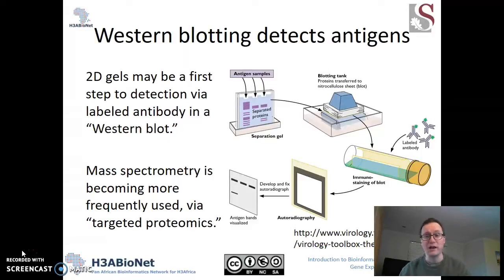So Western blotting is the answer to that. Now, Western blotting has long been considered kind of the gold standard for how you prove that this protein you're claiming is really present. And yet, there are a lot of weaknesses to this. What if you can't get an antibody that is specific to this protein of interest? So a lot of folks are trying to move away from the use of antibodies to use mass spectrometry instead.